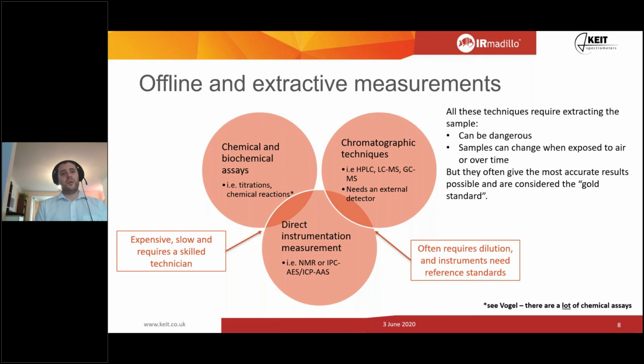And we tend to notice, working with customers and clients, that samples taken at around about this time of day are normally quite trustworthy. Samples taken at 2 a.m., less so. And that's simply because people get tired. It happens. So these techniques are very powerful, but they all have drawbacks.